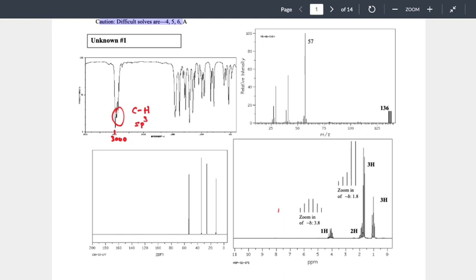And that's a common statement. They're not important ones. It's absolutely false. Every peak we see is important. It references a type of bond. All right, so let's lean on it. Why do you think they're not important?